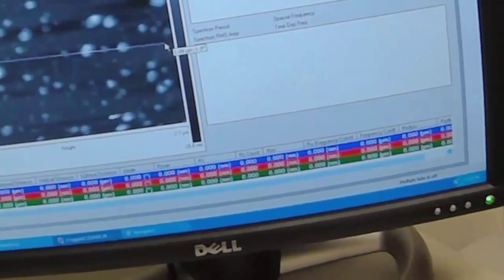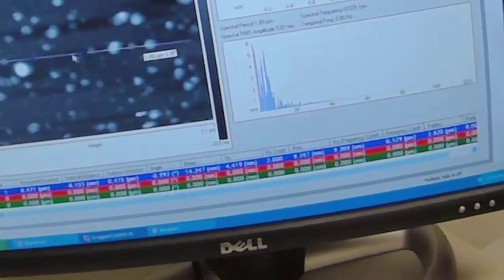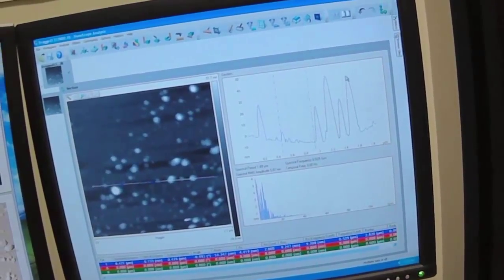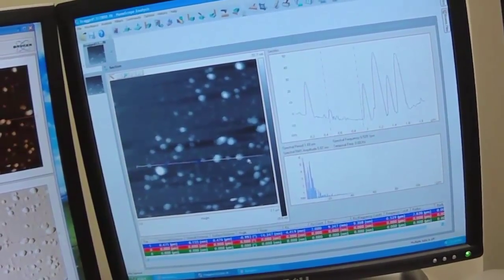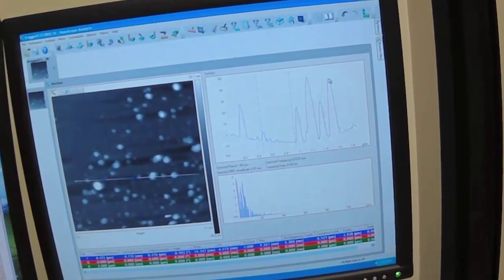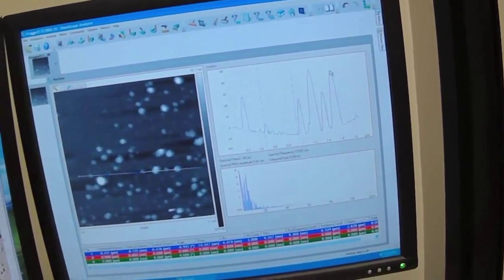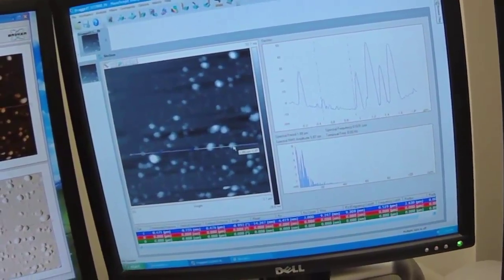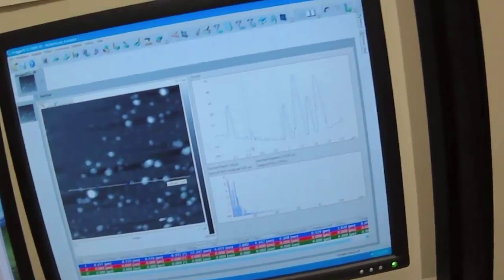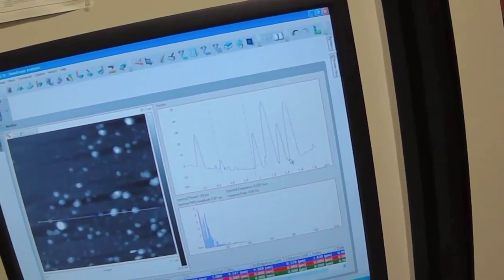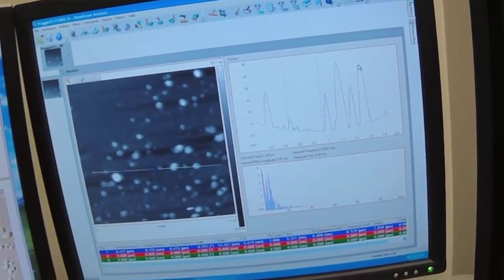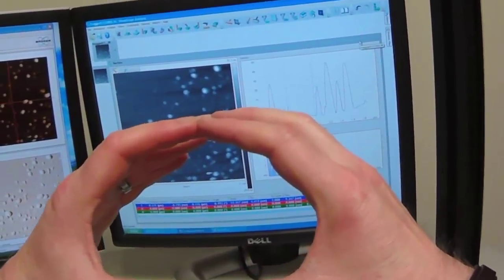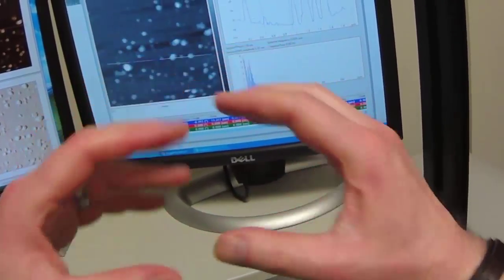I'm going to try to go through the middle of a bunch of spots because then that means my profile of this line, which is displayed here, if I go through the middle of this bright spot here, then this peak or this profile is the top of that spot. And by looking at the height measurement, we can determine the radius or diameter of our nanoparticles if it's a sphere.